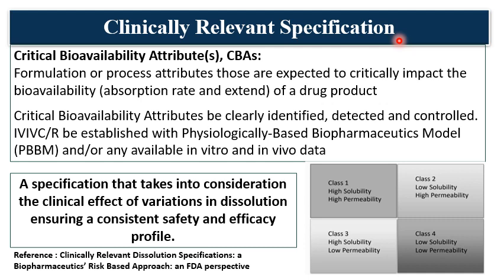The specification which takes into consideration the clinical effect of the variations in dissolution, ensuring a consistent safety and efficacy profile, is called the clinically relevant specification. That means your dissolution specification is directly related to the action of the drug. So in vitro and in vivo action is correlated, and on that the clinical relevance is justified.